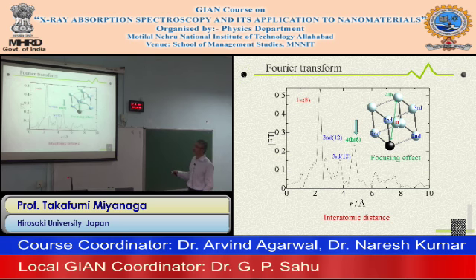For the BCC systems, it is difficult to distinguish the first peak and the second peak. Usually, including these two peaks, we obtain just one peak. And the third peak is here, the third nearest neighbor. And it is interesting that the fourth peak, the fourth nearest neighbor, is very large.